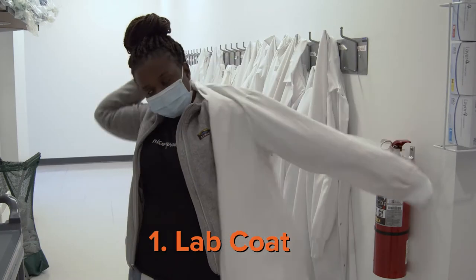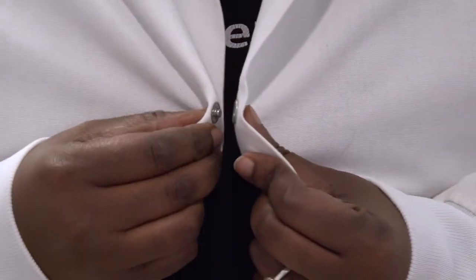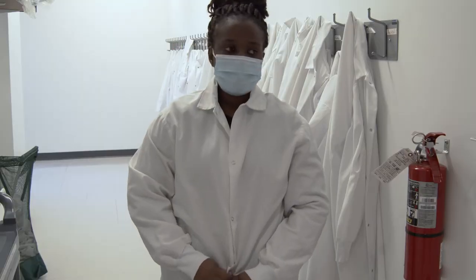Let's get started with PPE. Number one: your lab coat. Your lab coat should fit well and snug to your body, and it should also be buttoned all the way. This is to help protect from spills and potential accidents that can happen in the lab.